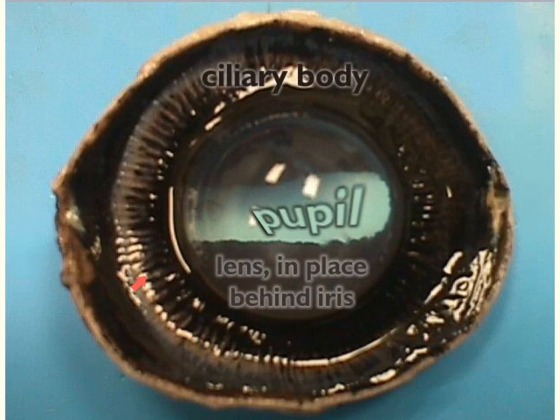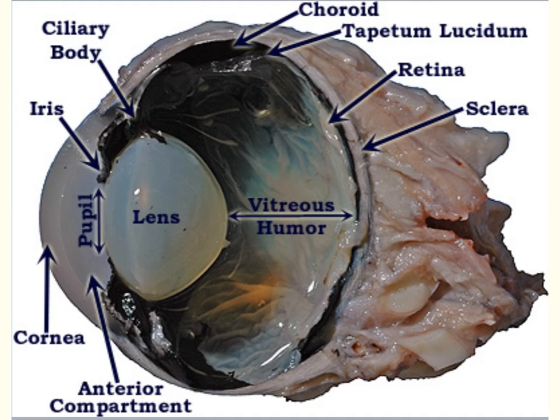This is the inside of the anterior portion — the front part of the eye. We can see the ciliary body and the opening, which is the pupil. The lens would be held in place here behind the iris. The iris is the color of the eye — so if you have blue or brown eyes, that is the color of your iris.